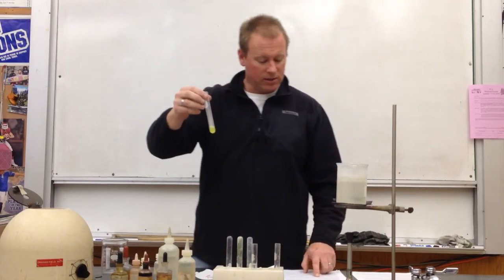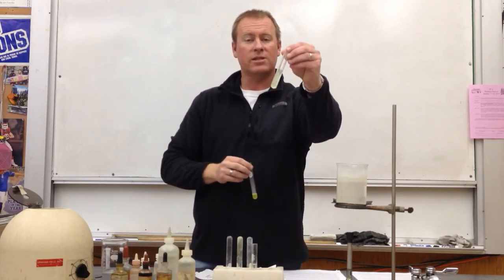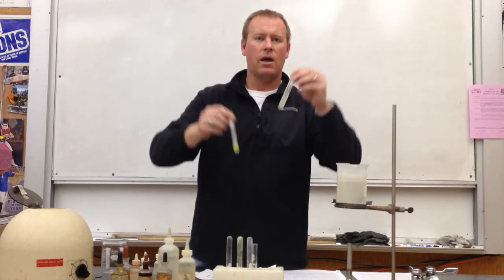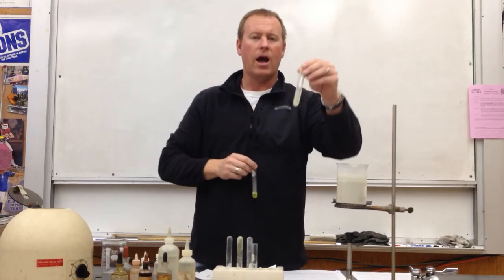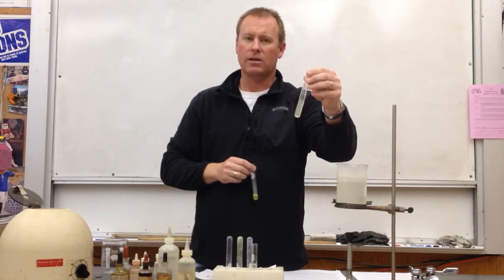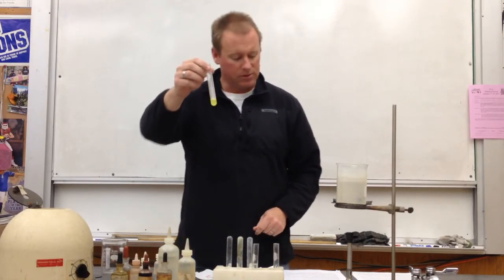As you continue reading, it says, at this point, if there are 2 test tubes, they may be combined. Meaning, if I had continued with this one from step 5, my other half, and had continued so that this test tube that I have now and this tube were identical, then I could go ahead and pour the 2 together. But I stopped with this one and just labeled it step 5, that it was not yet basic. So I can come back to this at any time if I need to. But right now this solution is enough for what I need to continue to do here in step 6.